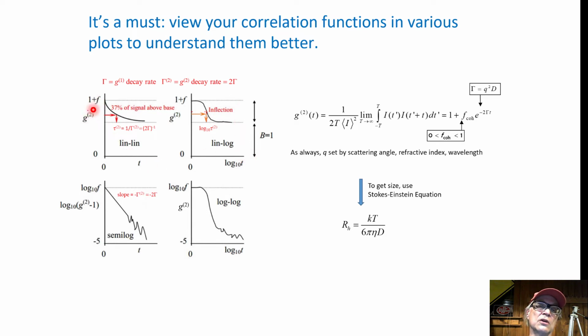One of them is linear, the parameter y versus t in this case. Linear on this scale, linear on this scale. Yep, that's how an exponential decay looks. That's what we think of as exponential decay. You also want to make a plot where you leave the y-axis linear, but you let the x-axis be logarithmic.